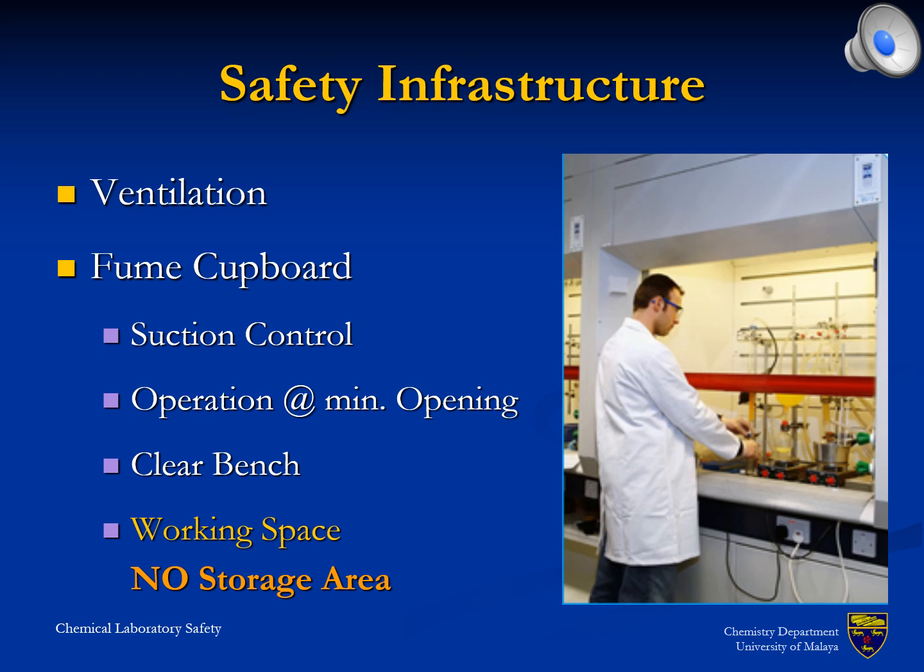Vapor hazards of chemicals are typically addressed with fume hoods, where developing vapors are removed by exhaust ventilation. Safe operations on fume hoods, however, require the window sash to be mostly closed. Moreover, the ventilation should not be compromised by unnecessary obstacles. Fume hoods, therefore, must not be used for storage and operation at the same time.